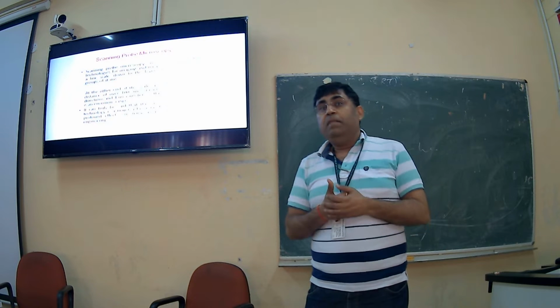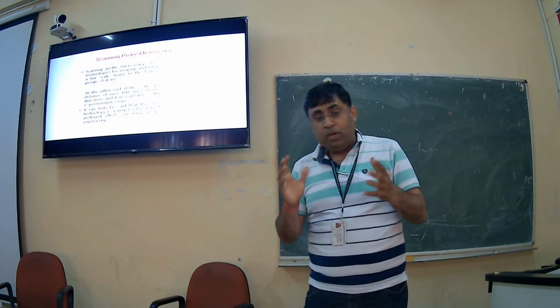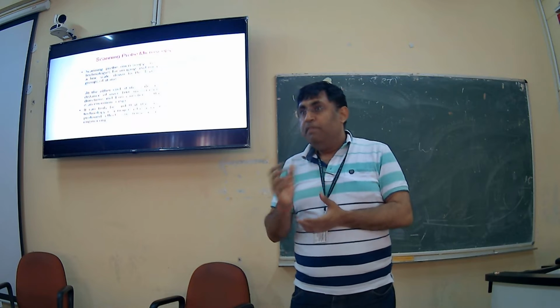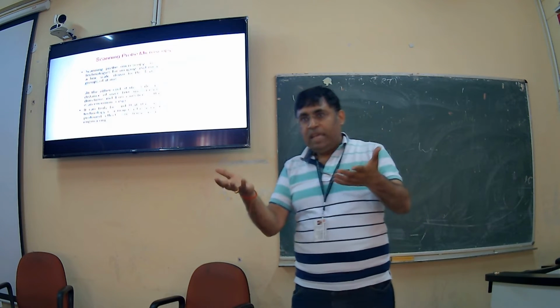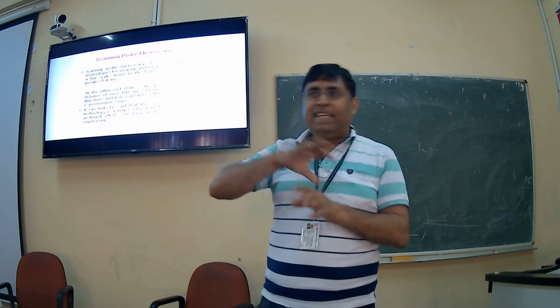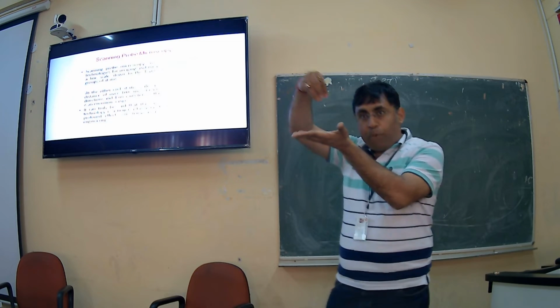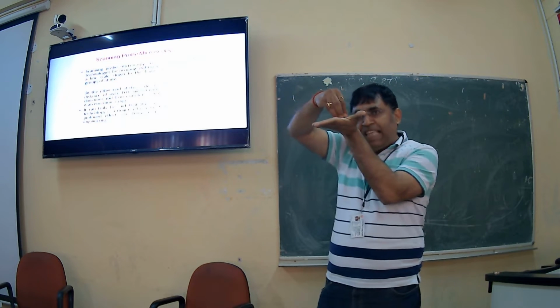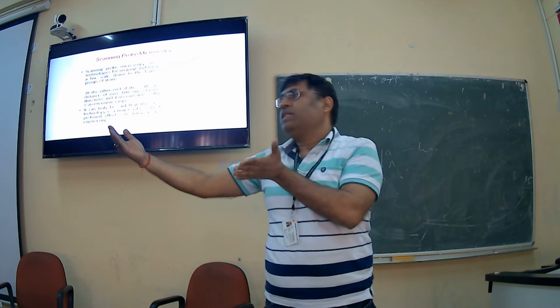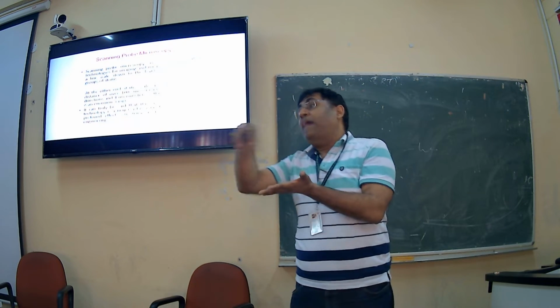Sometimes a scam happens or some unwanted thing happens, and the government says we will probe, we will investigate. Probe means investigation. So by going there you will investigate. Same way, scanning probe microscopy. Here a probe will touch the surface and then create an image on the computer. So that's why it is known as scanning probe microscopy.